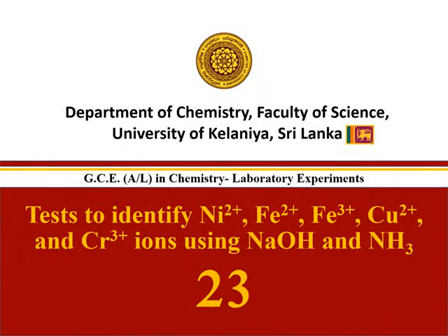Experiment number 23. Test to identify nickel 2+, Fe2+, Fe3+, copper 2+, and chromium 3+ ions using sodium hydroxide and ammonia.